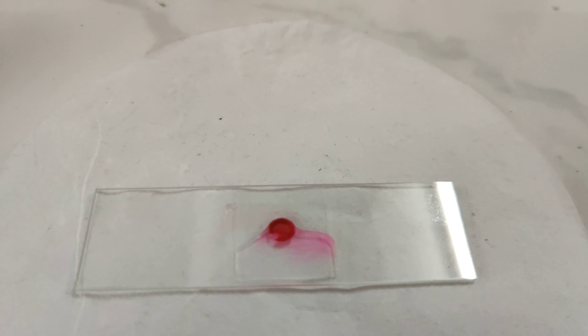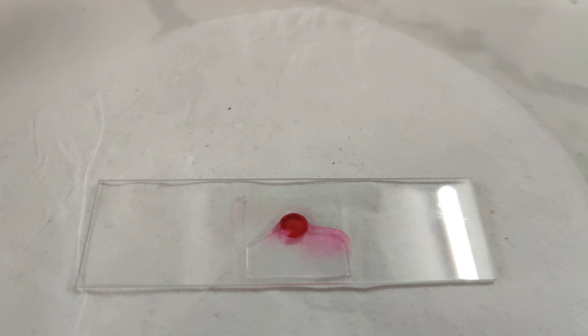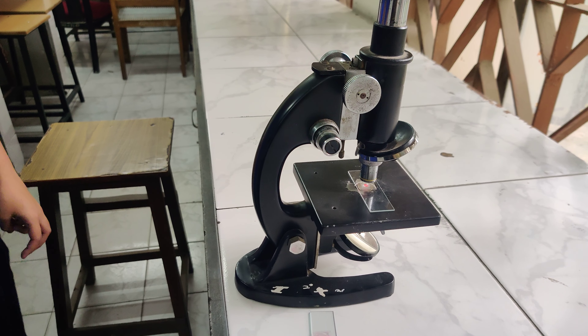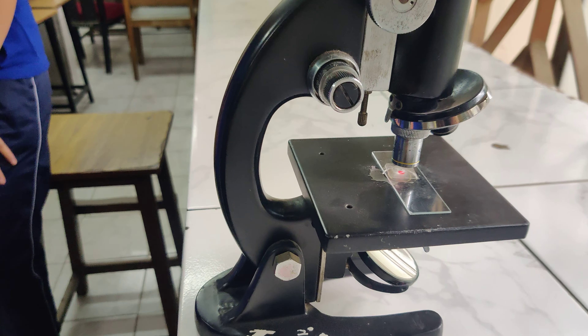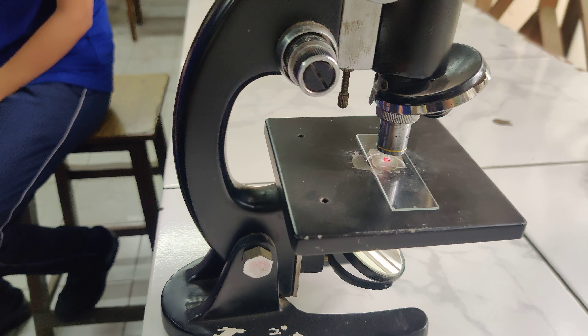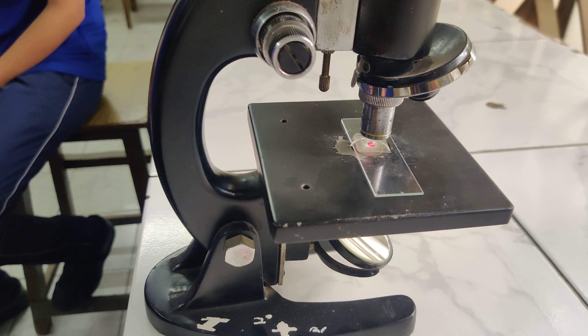This is our TS of dicot stem which we will see under the microscope under 10x. This is the microscope. We place the slide on the stage under 10x and observe each and every cell. This is the section of dicot stem under the microscope. We can see the wedge-shaped vascular bundles with the pericycle.